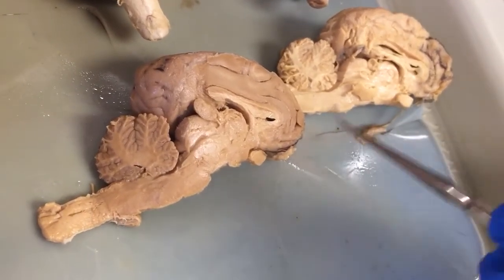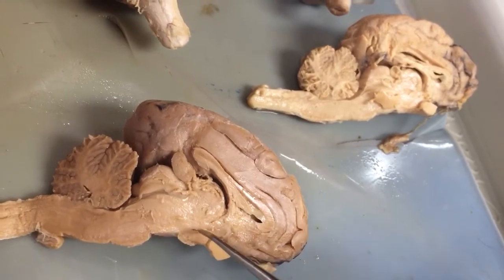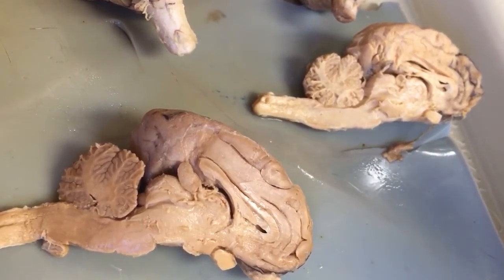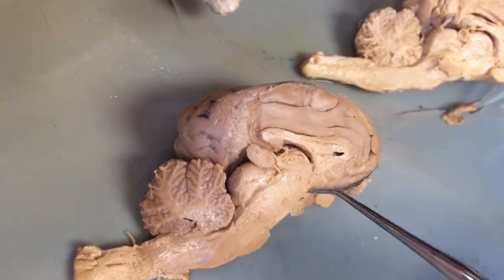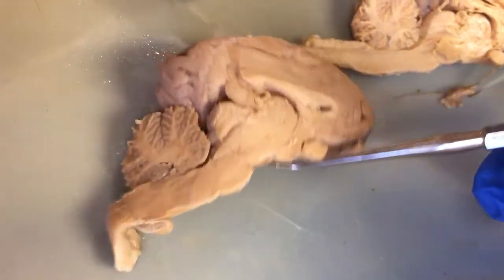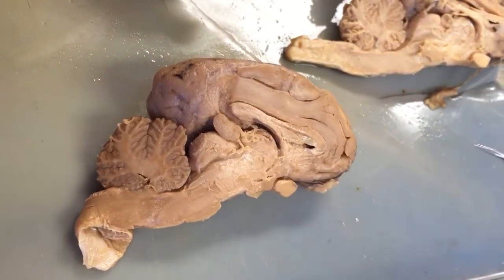It's not really clear in that one because you have to be right in the middle with your cut. There's kind of a groove there. It's the lower one, between the anterior commissure and, let's see, the mammillary bodies. So this is the mammillary bodies. This would be your third ventricle, and this is your anterior commissure.